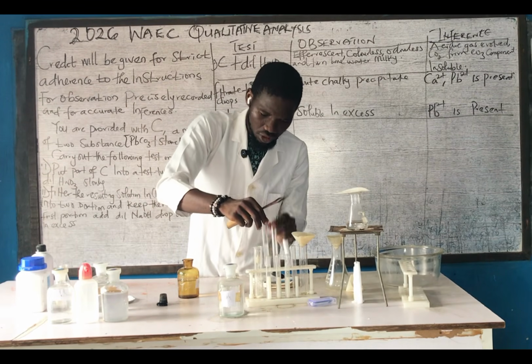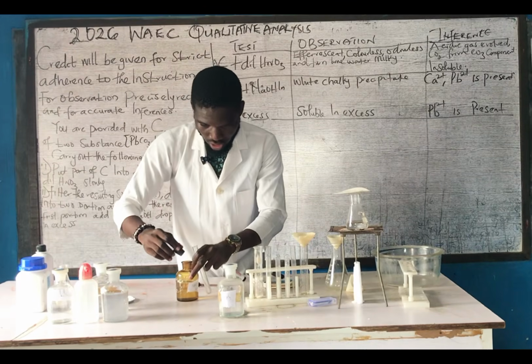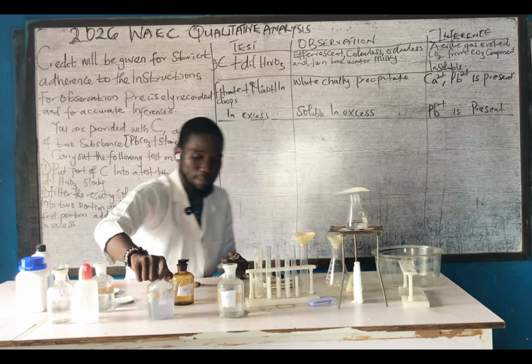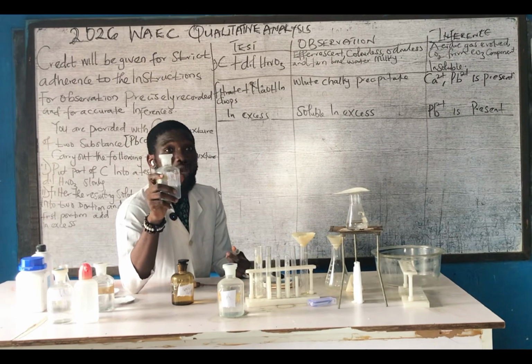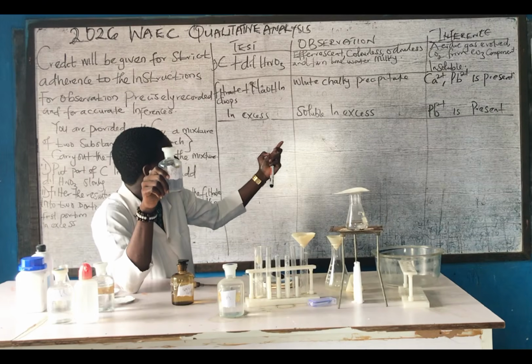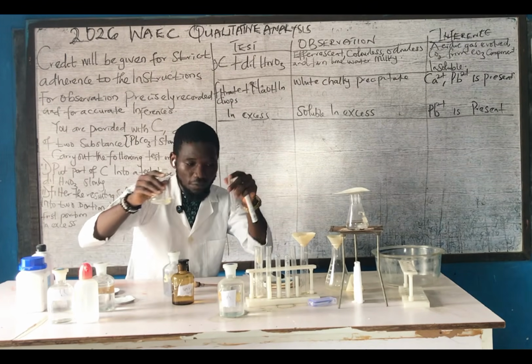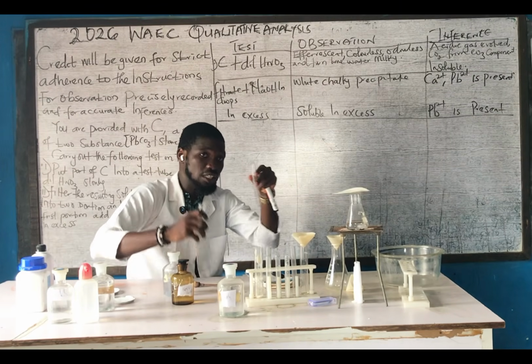Now, I'll pick up another test tube. Are you with me now? You close this now. So this is another reagent we are asked to provide. If you are a tutor or a student out there, please listen and listen well, and see the way I'm arranging it accordingly. So now, I'm going to use the filtrate. Please check if you have water in your test tube.